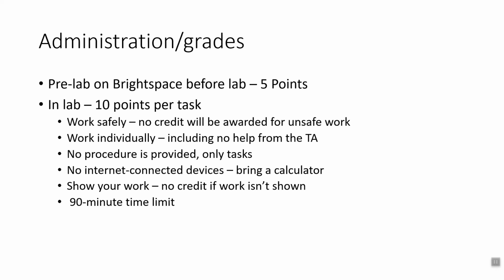So there's not going to be any internet connected devices in the lab. No cell phones, no computers, no nothing. This is administered like a test. So in lab, it's 10 points per task, and like I said, there's really only 2 tasks, okay? Because the dilution and the titration are one task, okay?